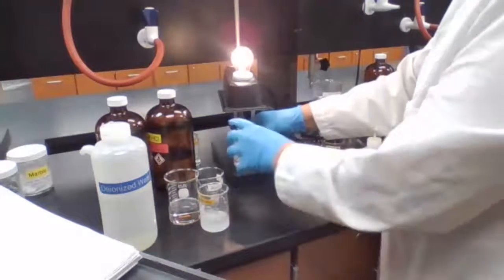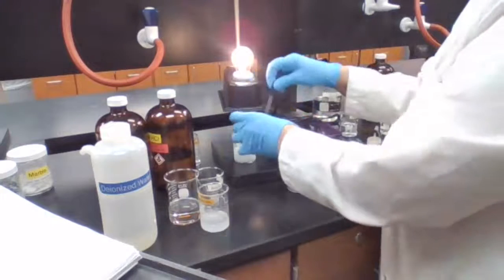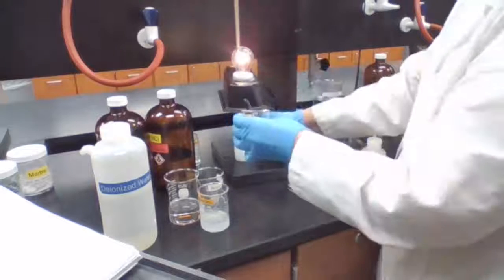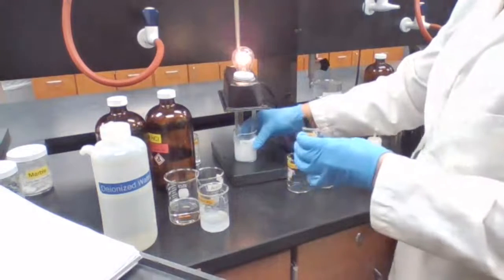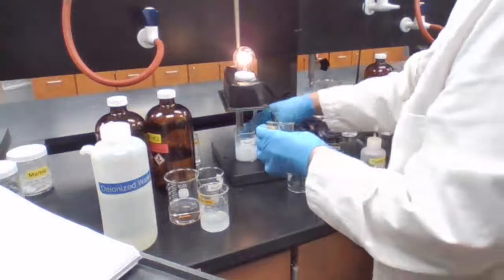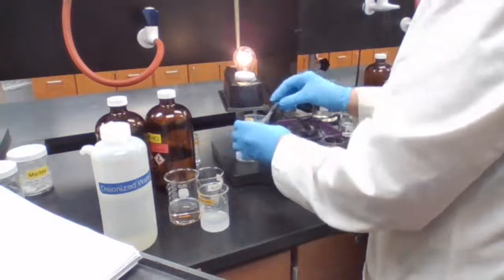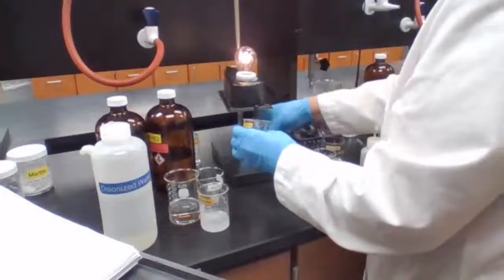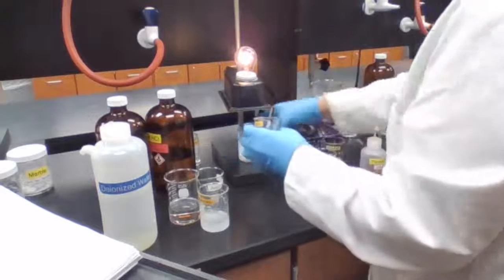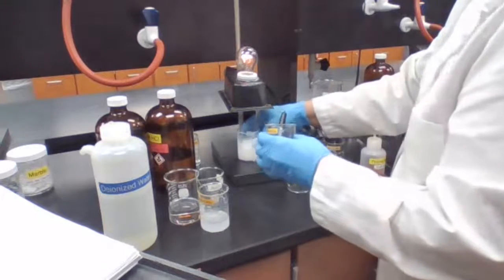It has to neutralize. I have to add enough for it to neutralize. See, the light is getting dimmer. And at one point, if I add enough of the acid to neutralize all the base, it's going to actually turn off.